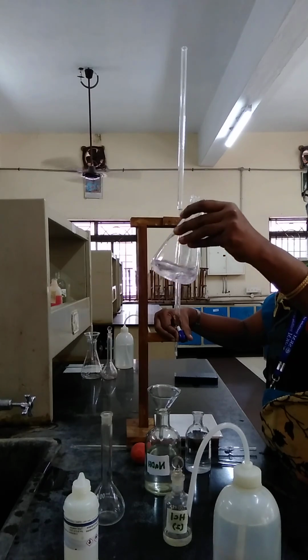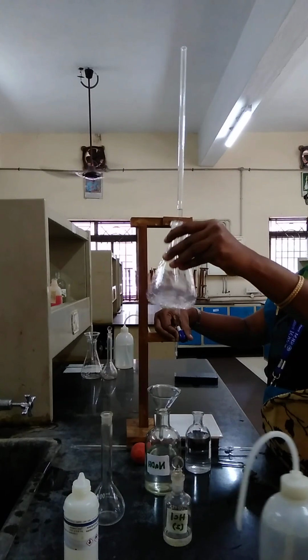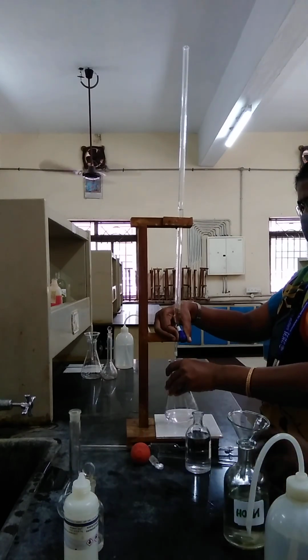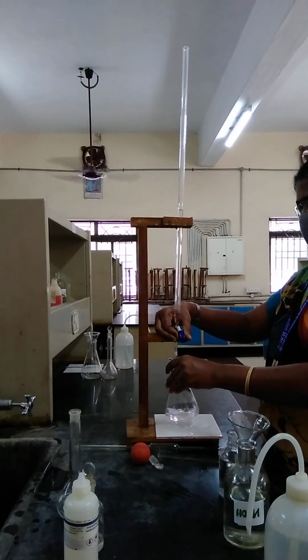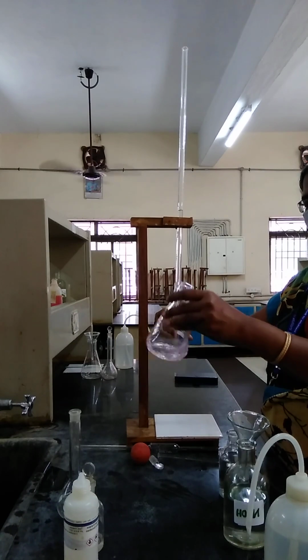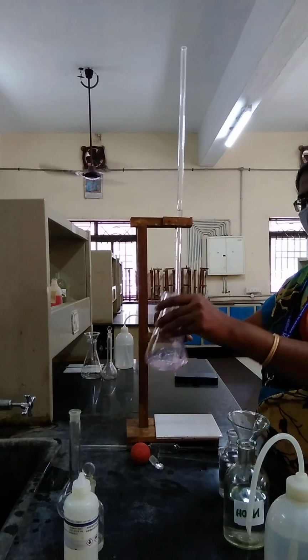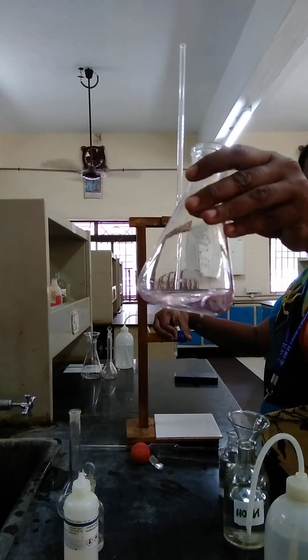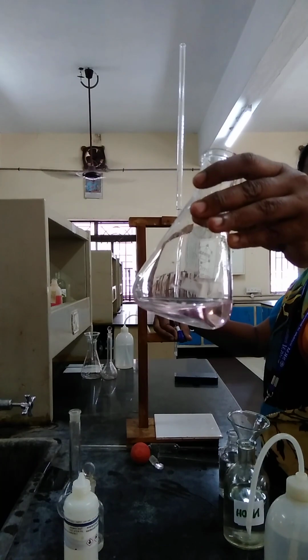It's not a clear pink that's showing. Yes, pink color. You can see the pink color, right? Yes, you got the permanent pink color, right?